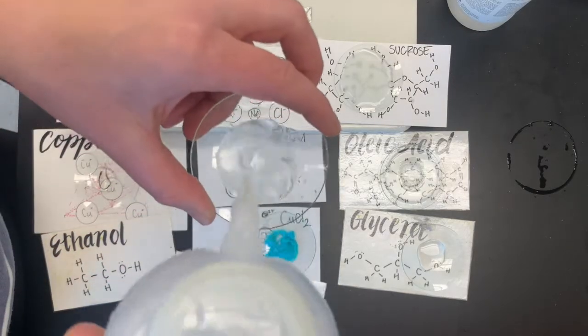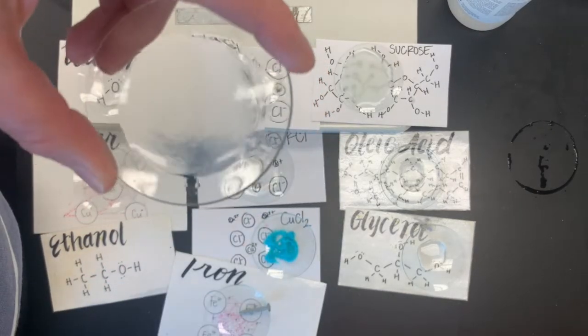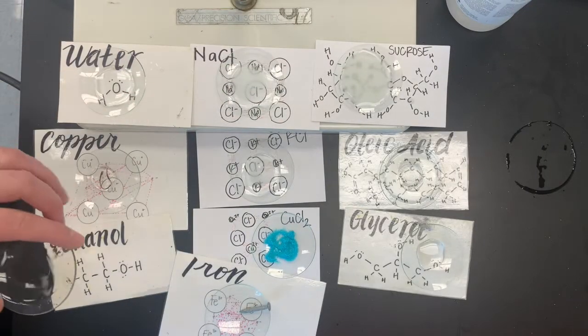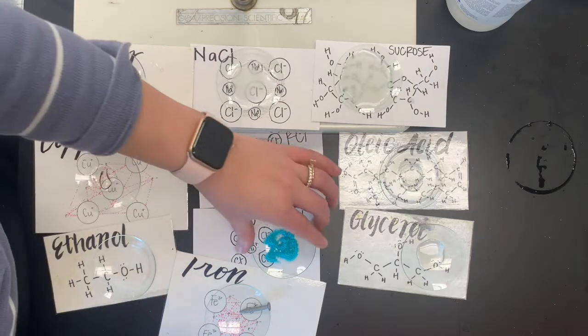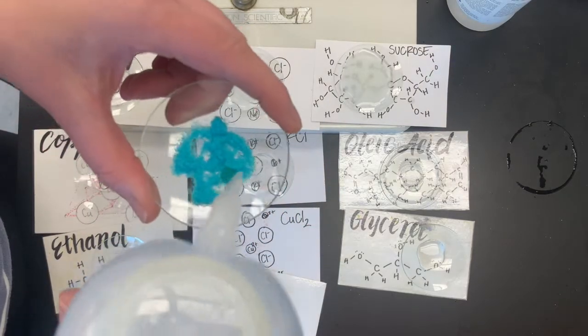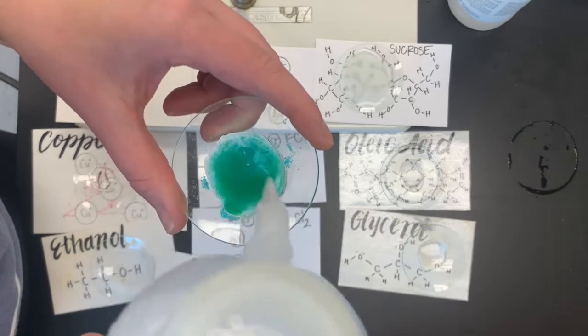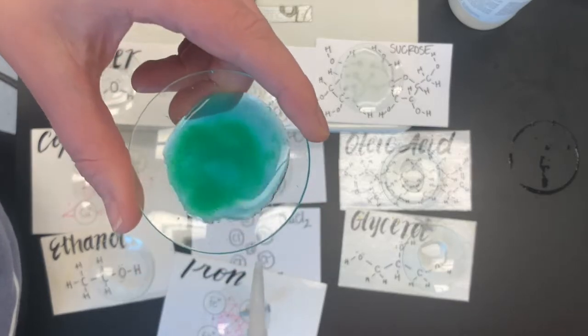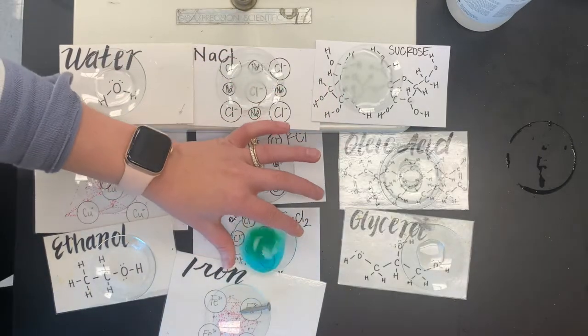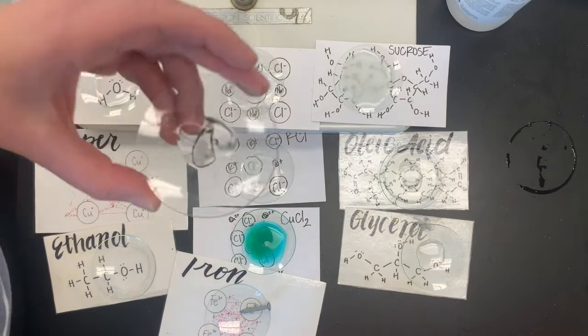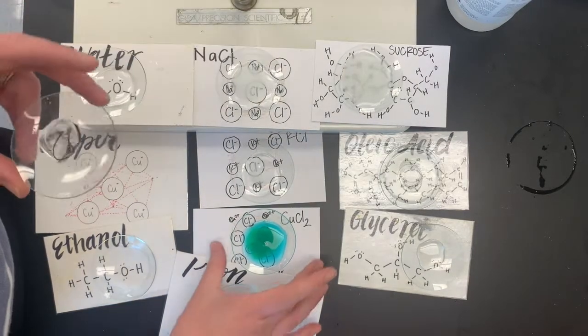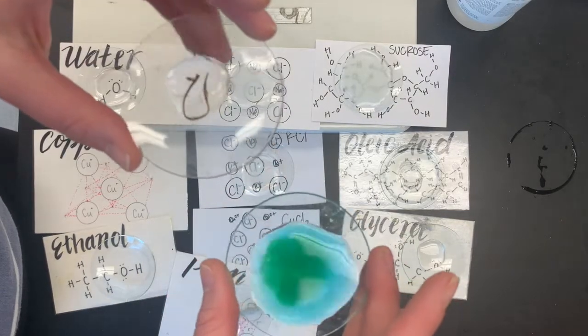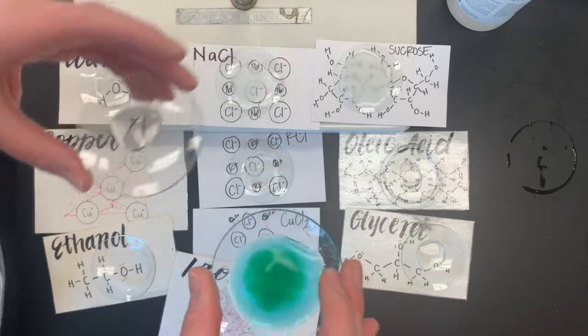Ethanol and water. Can you see those crazy lines in there? You might have to just decide what you think that is, if you think it's soluble or not. Copper to chloride. I just love it. It makes such a cool color. What do we see? It looks like the actual liquid is turning blue. I would say that that copper is dissolved in there. One thing I love thinking about is this is pure copper. This is copper bonded as an ion to chloride ions and such a difference. This just has those chloride ions added.